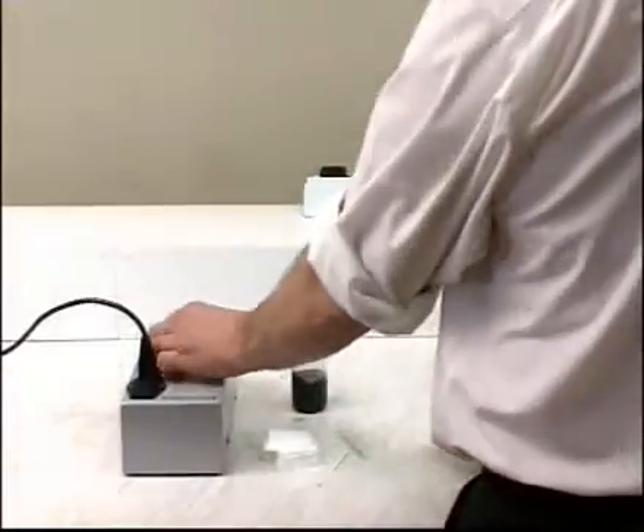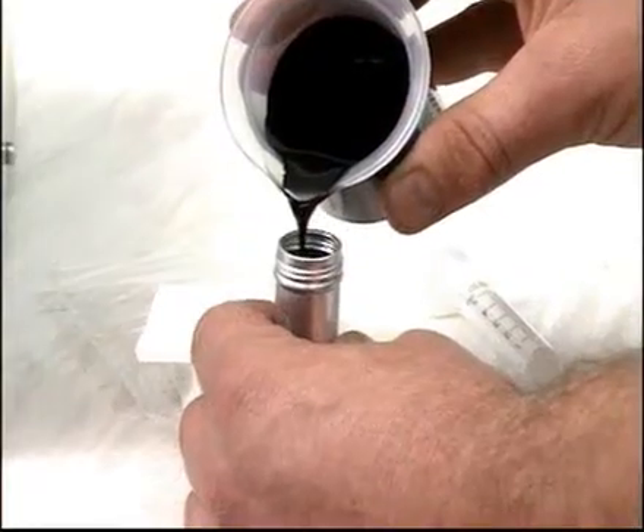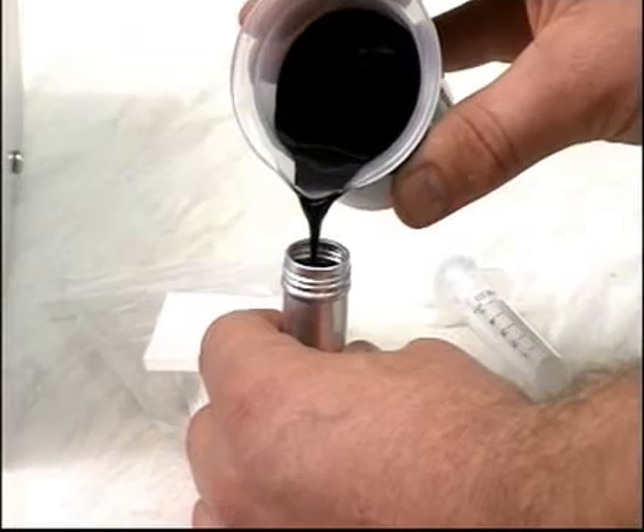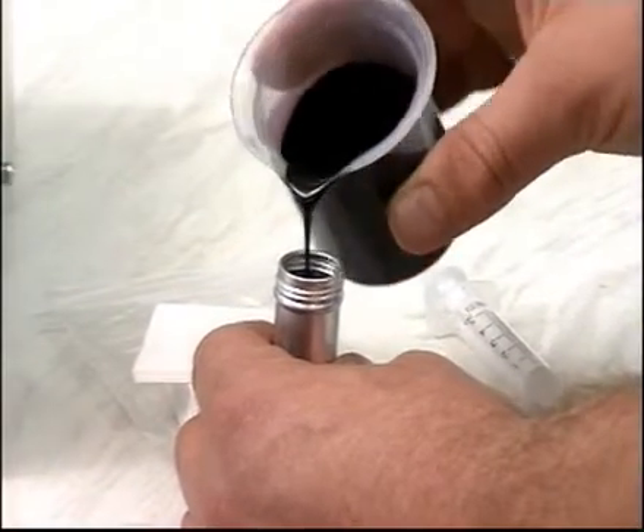Shake a representative sample thoroughly just before testing. Heat to aid pouring if necessary. Begin by testing for stability. Pour a sample of oil into a beaker, then pour about 10 milliliters of oil into the sample tube.